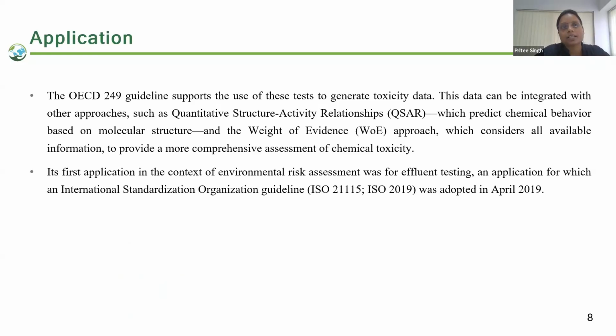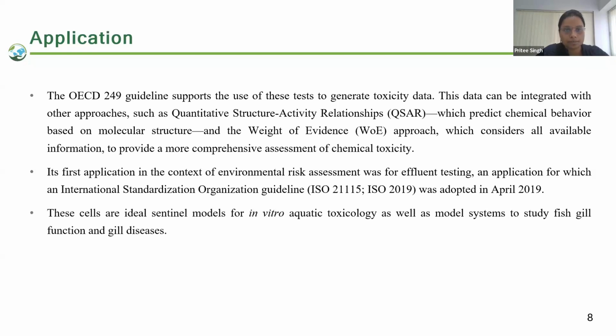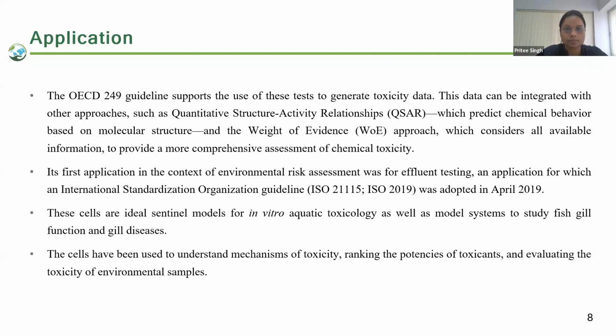Its first application in the context of environmental risk assessment was for effluent testing, then application for ISO guideline adopted in 2019. These cells are an important model for in vitro aquatic toxicology as well as for studying gill function and gill disease. The cells have been used to understand the mechanism of toxicity, potency of toxicity, and evaluating the toxicity of environmental samples.